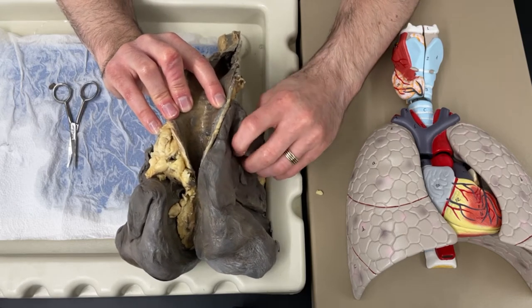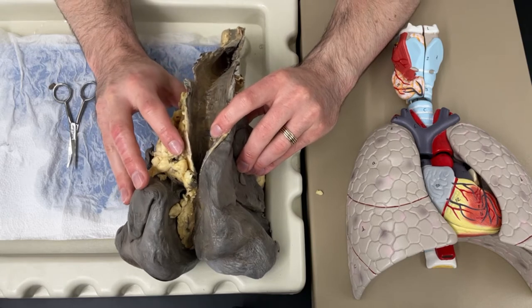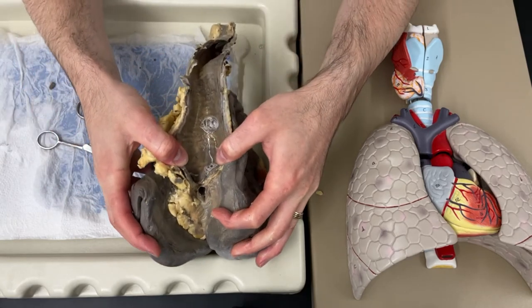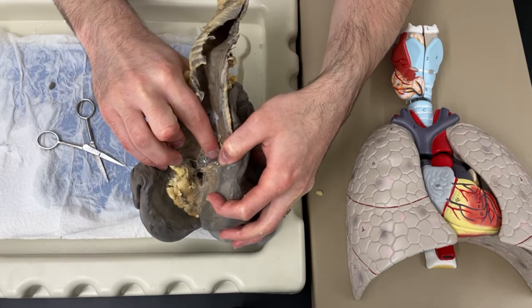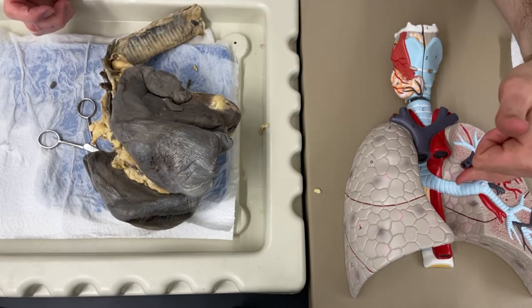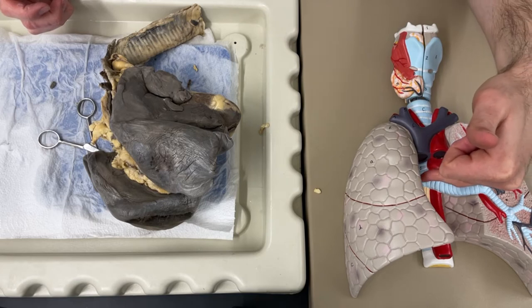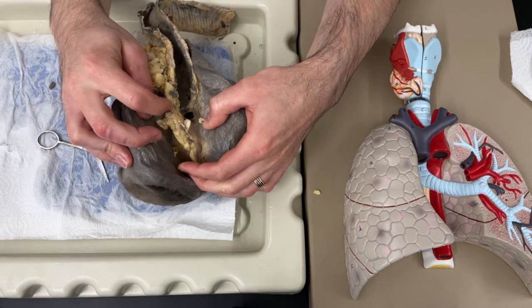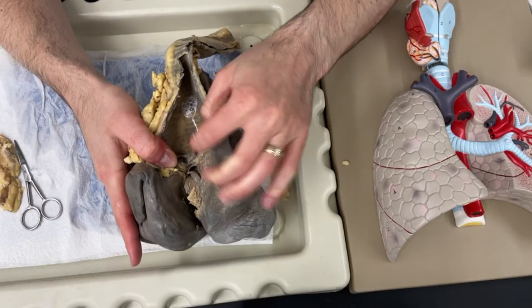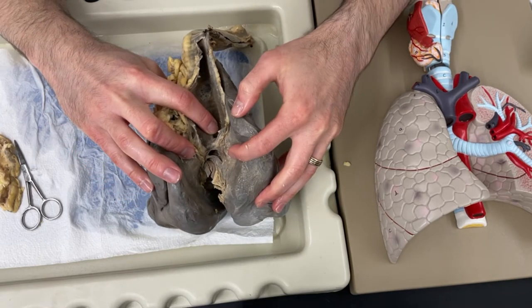As I squeeze this particular lobe of the lung, you'll see some juice come out. Normally that's just air in there, but since this is preserved in a solution, that's just some of that solution left over. Now I've gotten to a part where it's going to split into two halves - there's going to be one tube that goes down the left side and another tube that goes down the other side. On my human model, I've gotten to the part where I have one of the branches of the bronchi going into one lung, and another branch going into the other lung. There's also a lot of extra fat, so I'm going to cut off some of that fat to make this a little bit easier to see.